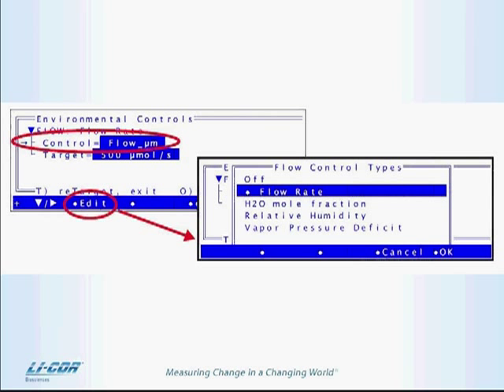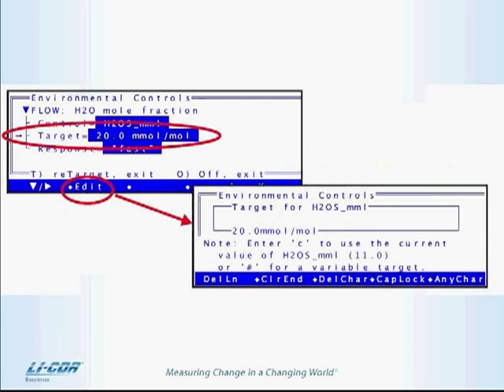These are not new options. Everybody should be familiar with them. But what you'll do is you'll pick one by using your arrow keys. And then after you pick that, you'll go down to target. So the same thing that we did before in the table in one line, we now do in the tree in 2 lines, just to make sure that everybody's clear on what type of control we're using and what the actual control is.